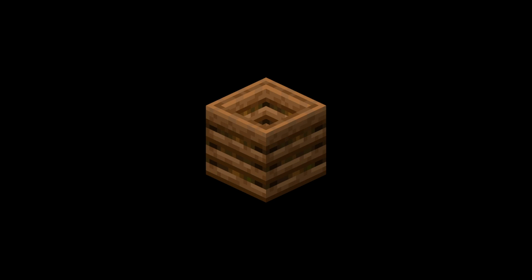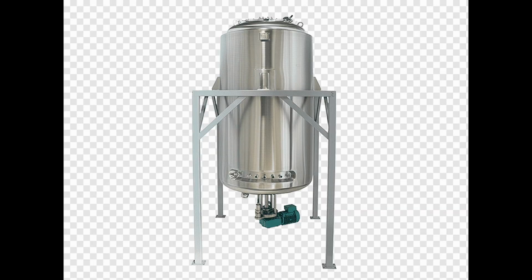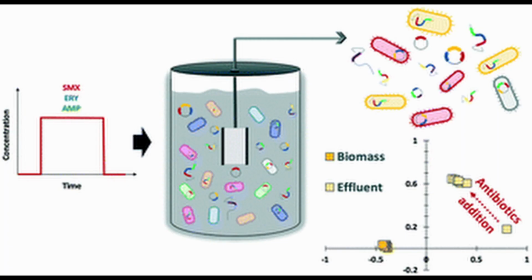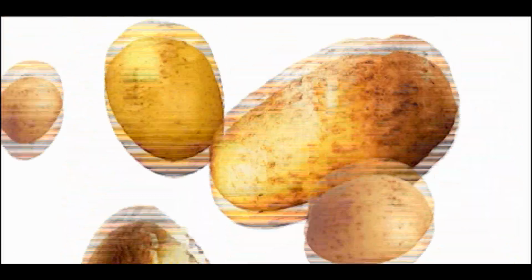So then a bioreactor is basically just a thing which you can put another thing in to get a different thing which you need or which is just more useful in general. As such, it can take many forms and shapes depending on what you need it for, what you want out of it, and what you're putting in, what the substrate is.